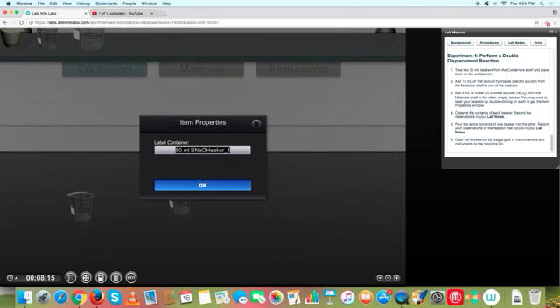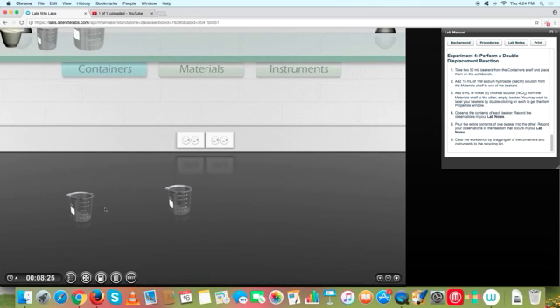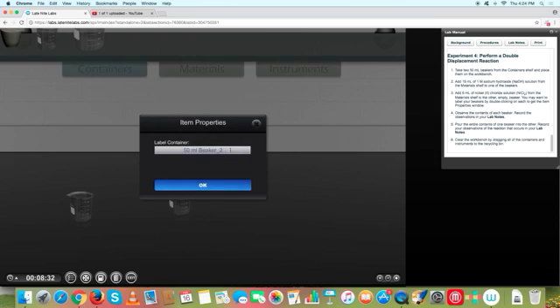Looks like you have to clear it out first. And then you can type in NaOH. And on the other one, see, now it says NaOH on it. This one will do the same thing, except we'll put nickel chloride, NiCl2.